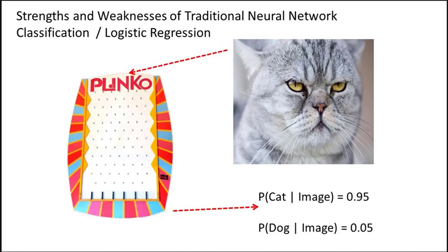But this problem is also applicable to the dog and cat problem. So I'm going to use a more easy to understand set of images to show you what the issues are with this kind of supervised classification approach and why it's a problem for a pharmaceutical application. Imagine our neural network is basically a black box technique. What it really does is take an input image, process it, and then predict the class probability of this thing being a cat or a dog.